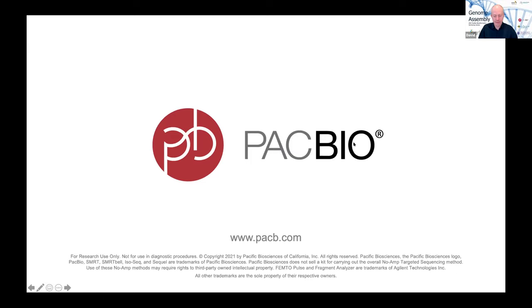Just another one. We've got Yuki asking, I'm currently trying to learn how to use Minimap2. Do you have a recommended online resource to learn how to use the tool? Is that something available through GitHub, or how would you start to learn that?